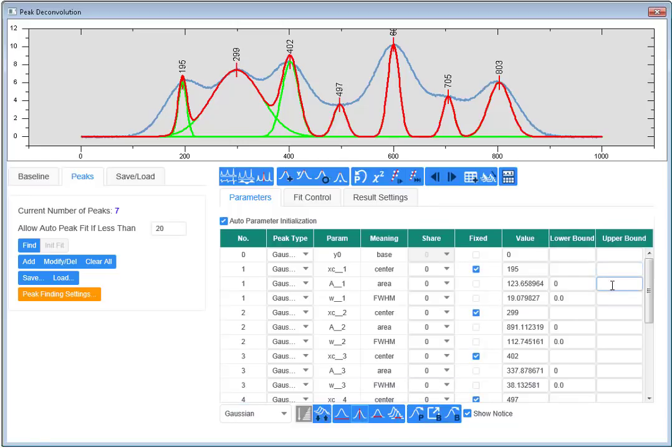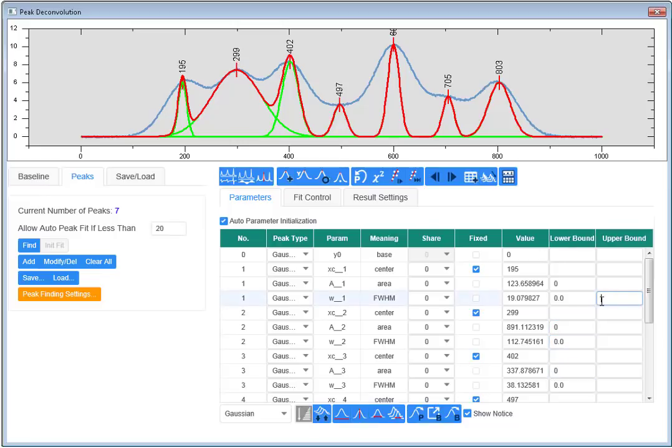The app has already applied a zero as a lower bound to all parameters. Let's say I want to restrict the width of this channel to be no larger than a hundred.